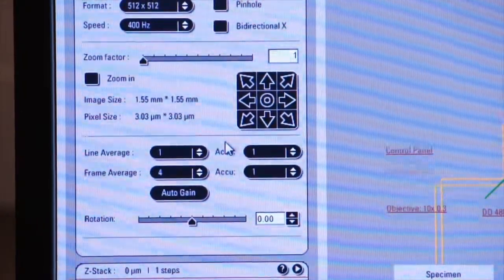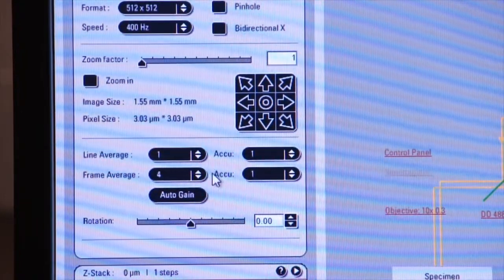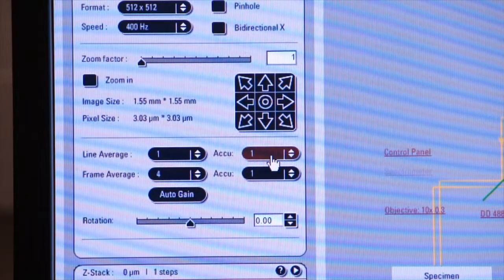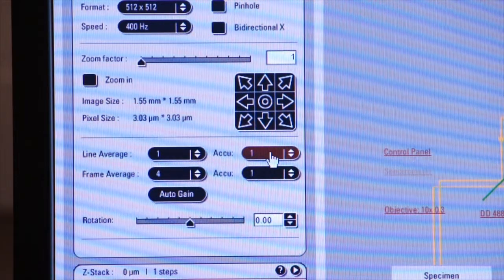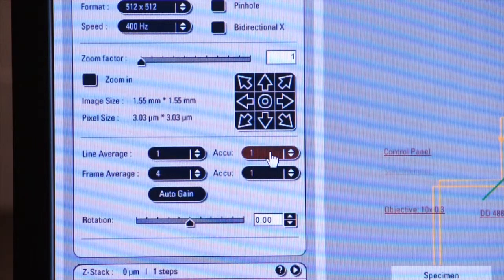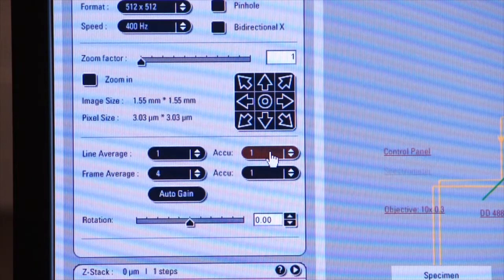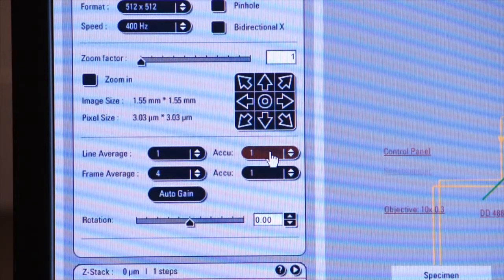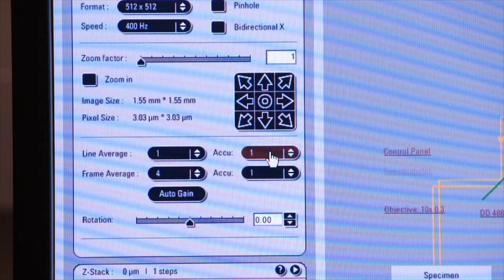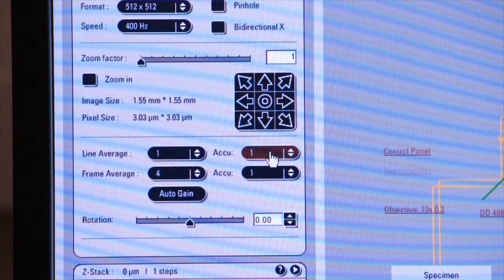Another feature that's useful on the left screen next to line and frame average is the accumulate tab. Accumulate takes an accumulation of each scan. If you have a low signal image and you want to boost the brightness of that image.